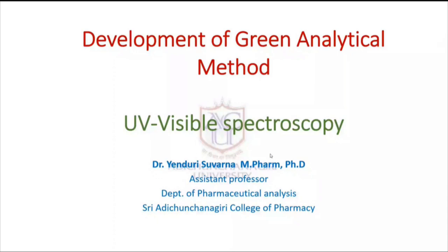Our today's topic is regarding the development of green analytical method using UV visible spectroscopy. So when we are undergoing the research work, and if our area of choice or the method we have chosen is the UV visible spectroscopy method, how do we have to assess the greenness of the method? I just want to show you some 3 or 4 articles which have utilized this greenness assessment by developing the method using UV visible spectroscopy.